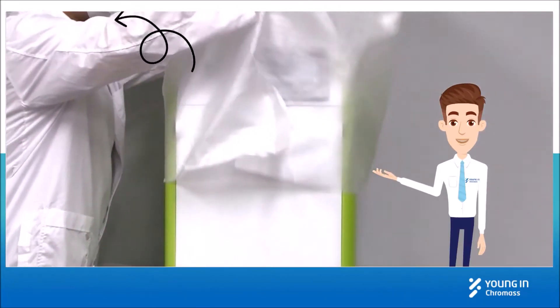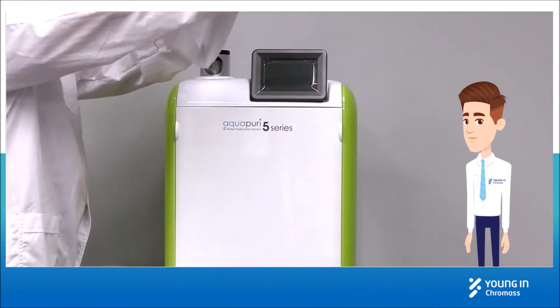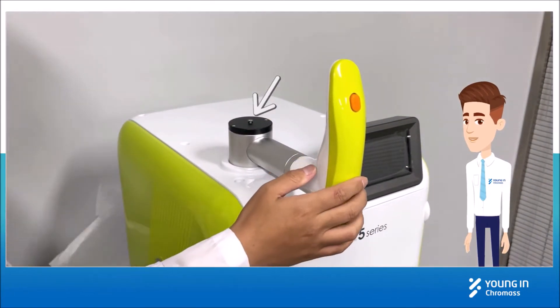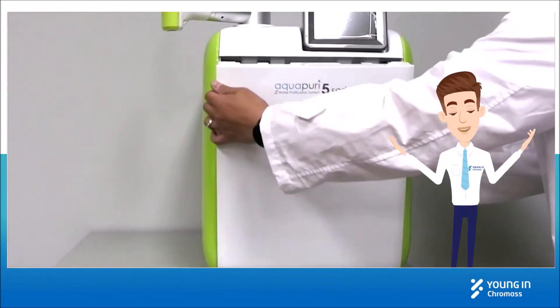Take off the packing cover, and take off the cover for the dispenser as well. Install the dispenser by tightening the nut on the top. Open the front cover.